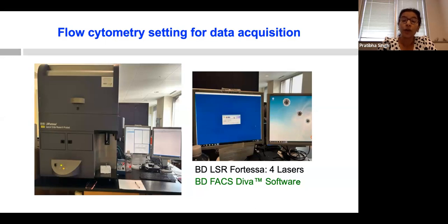FACSDiva software can be used to acquire the data and even for the analysis of it.